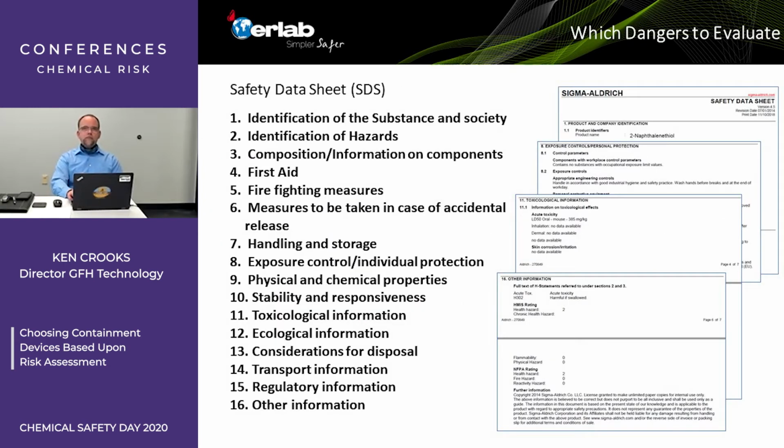Okay. So which dangers to evaluate? The safety data sheet has 16 chapters, and as Dimitri said earlier in the question and answer of the previous session, I absolutely agree.